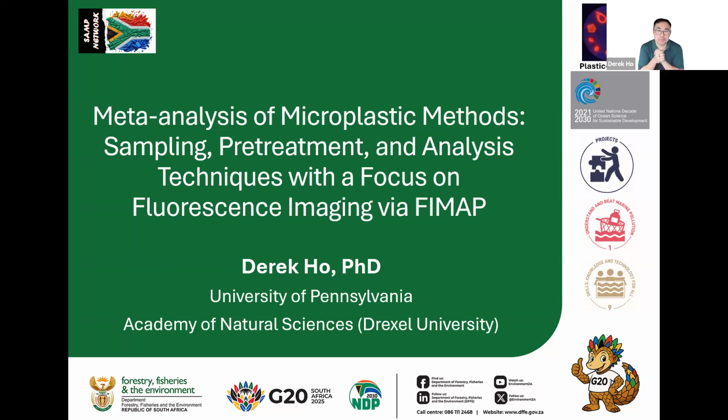Good morning. I'm Dr. Derek Ho, and today I'll be explaining my work on the meta-analysis of microplastic methods, sampling, pretreatment, and analysis techniques, with a focus on fluorescence imaging via FIMAP.